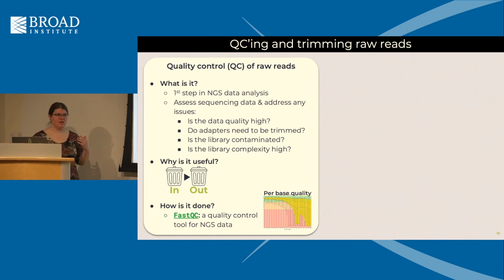It's something that you can spot check a little bit, but basically you want to make sure that you don't ignore that. I mean, GP is really good, Walkup is really good. We have fantastic people that work here who make the sequencers do really amazing things in incredibly fast and efficient ways. That being said, it's not like they don't occasionally get a bubble on the flow cell. And they usually know that because they do a lot of Illumina flow cell QC.